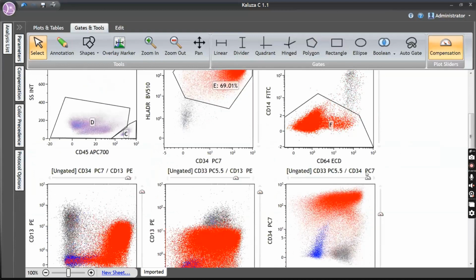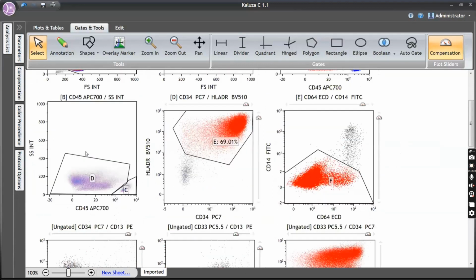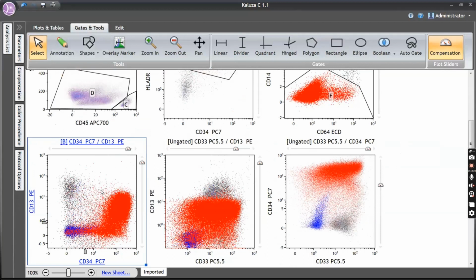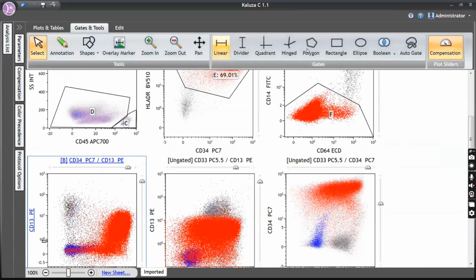So blast in red and lymphocytes in blue color. Right. So CD13 is positive in the blast, correct? You have the internal control here. So I'll play only B. Okay. So here's the normal neutrophil population. Okay. So you have all populations here. So neutrophil, which is, I'll just create them with some.